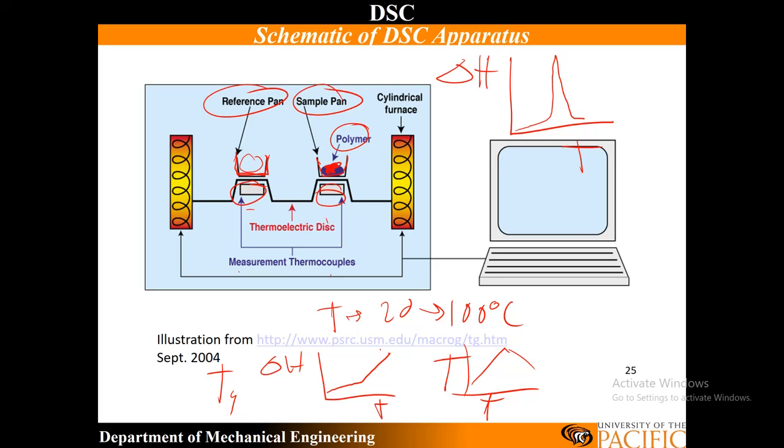So you get very repeatable, very robust results. It's an excellent technique to utilize. We are going to be generating and measuring different compositions of lauric and stearic acid, and we're going to develop that phase diagram.